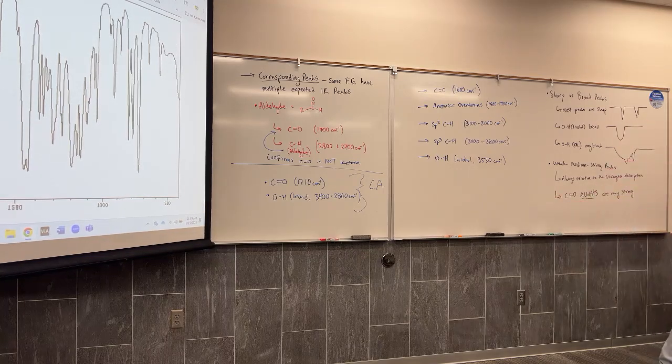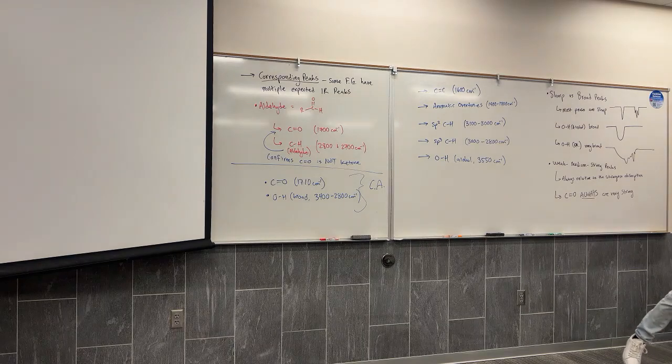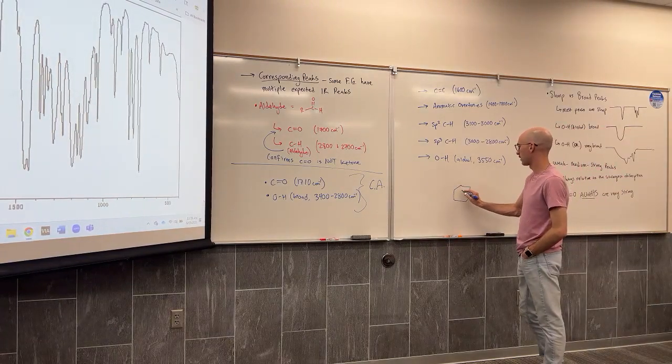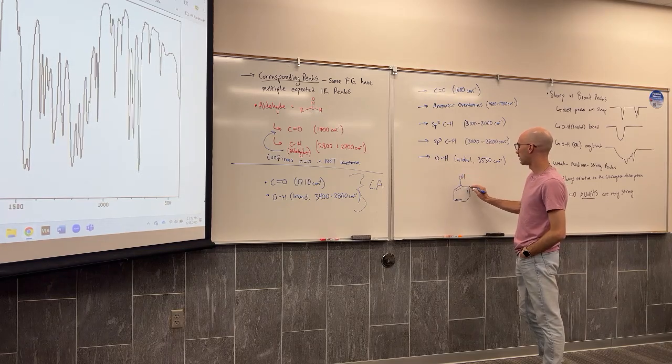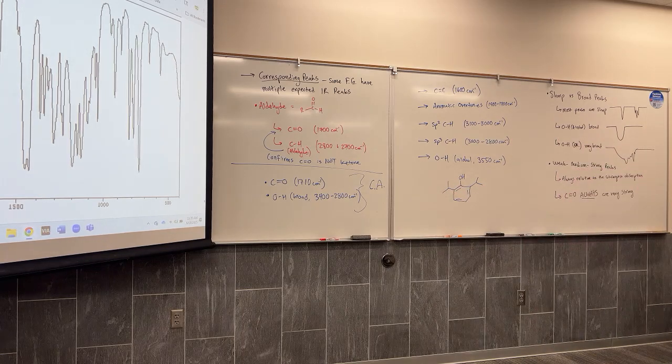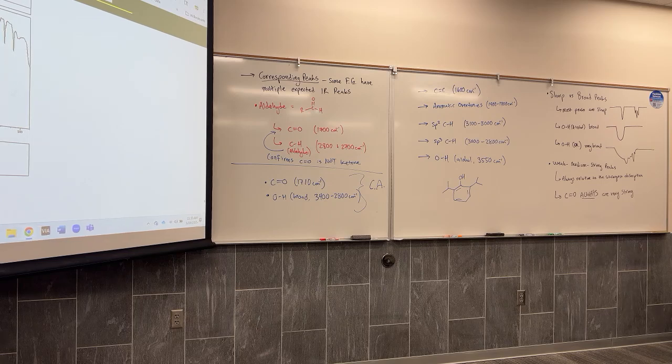Do you know the molecule now? No, you can't possibly know the molecule from its functional groups. We know that it has an aromatic ring. We know that it has an alcohol. And we know that it has sp3 CH carbons. I gave you guys propofol. Again, that's what we did at the end of class yesterday. But you would have never known. You don't have its molecular mass. You don't know if that aliphatic CH is from an alkane or just something that has an sp3 CH. You wouldn't know that there are two of them. And it's even hard to know that it's an alcohol.